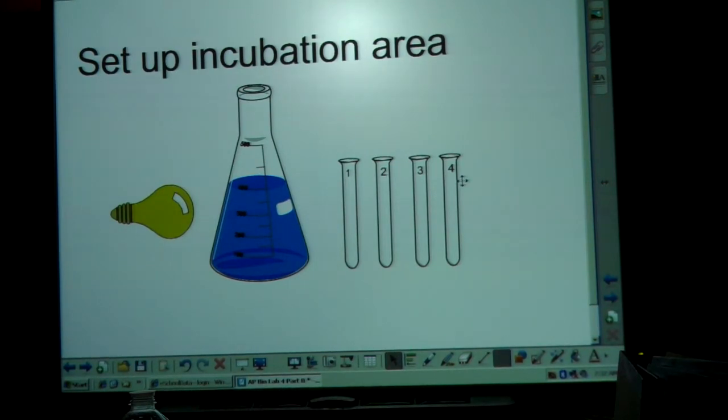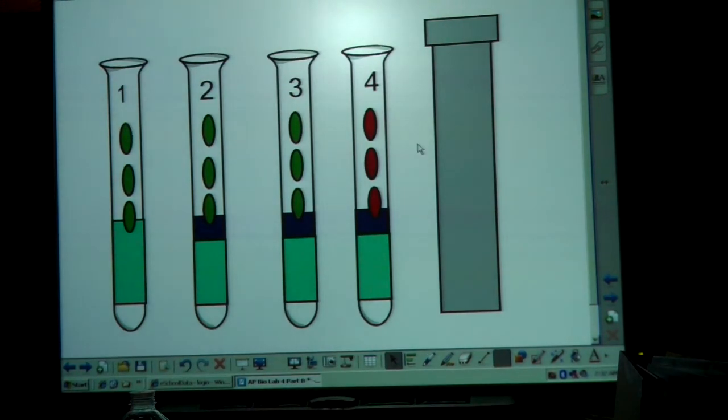Alright, so what you need to do here, you also need to get some aluminum foil ready to go for test tube number two. I'll talk about that in a second. And then what we're going to do here is in the four test tubes, test tube one, this is according to the lab, is going to get one milliliter of the phosphate buffer, four mils of distilled water, and then three drops of the spinach extract, the unboiled extract.